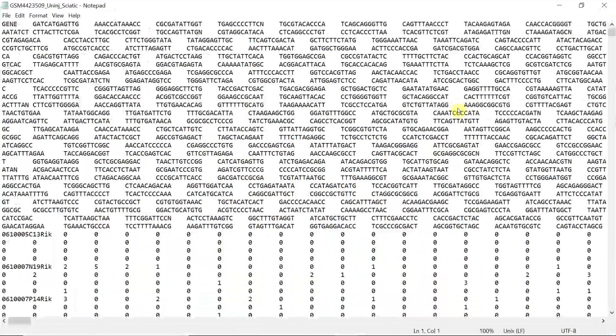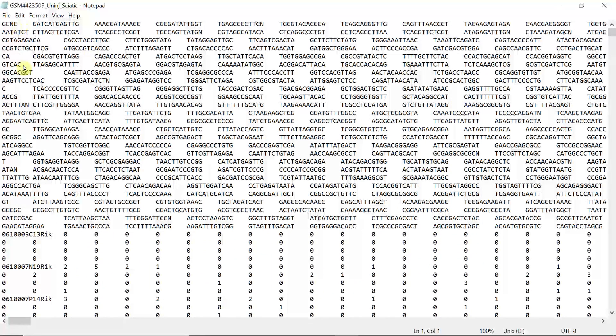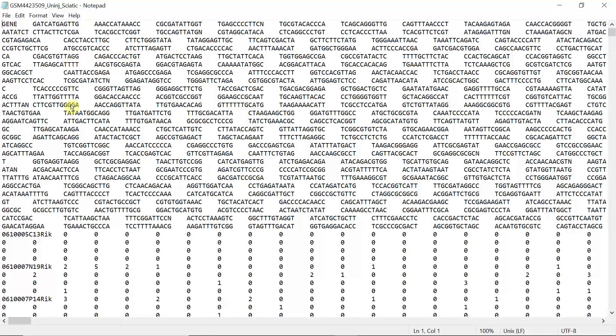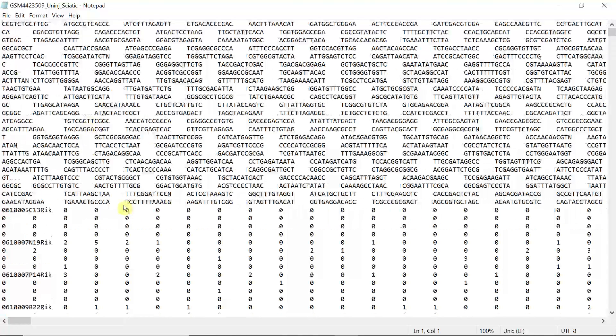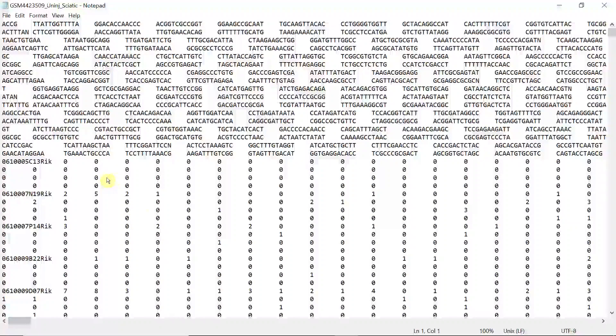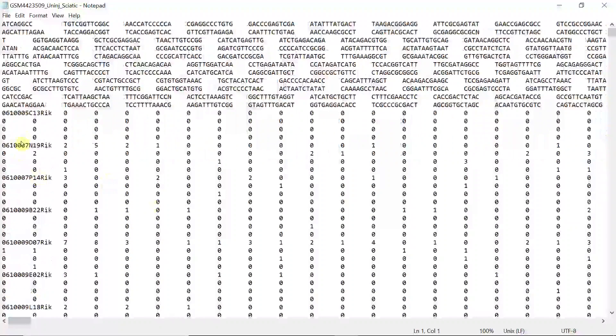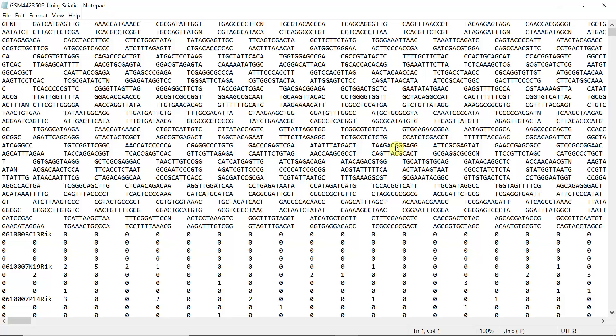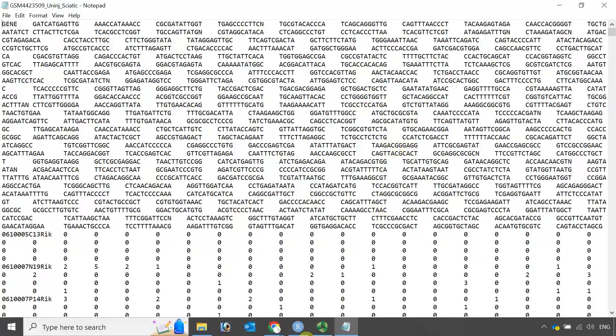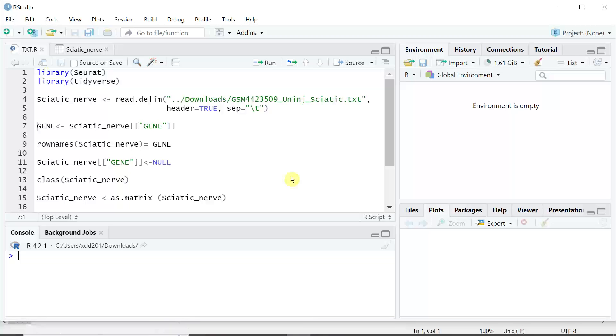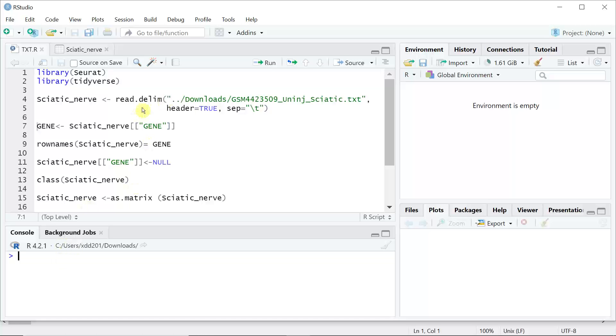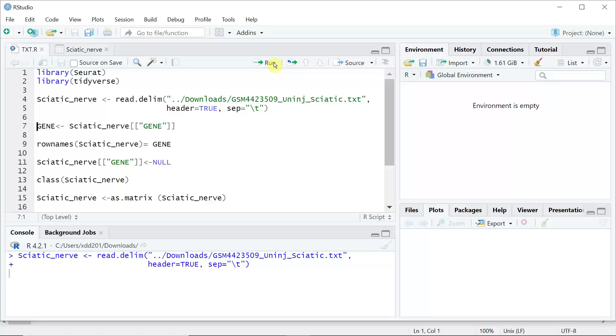You can see in the dataset that we have the barcode, the count, and the genes. Now we can read the data into R. In R, we have a function called read.delim to create a data frame from txt files. Let's go ahead and read the data into R.